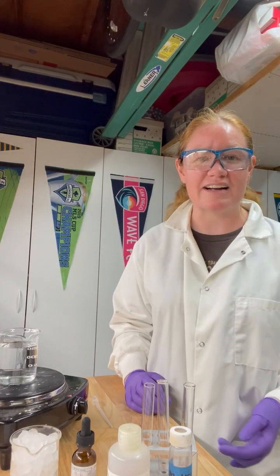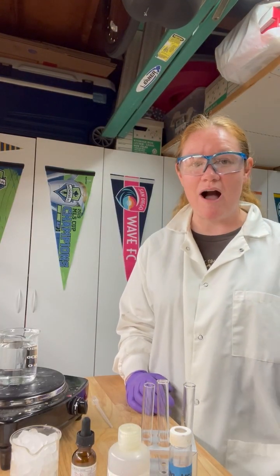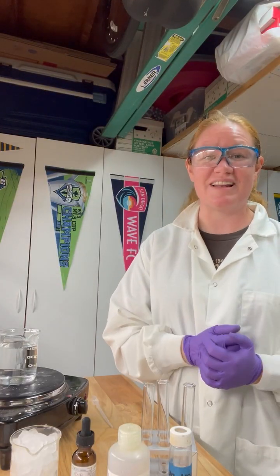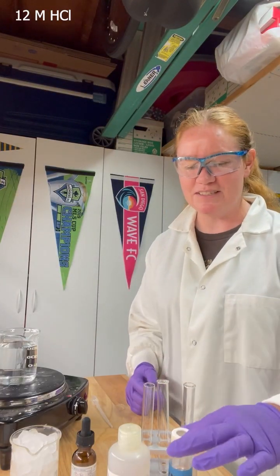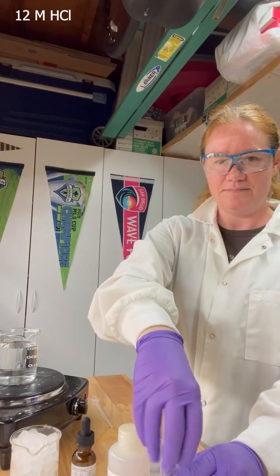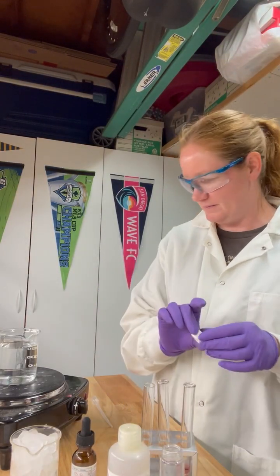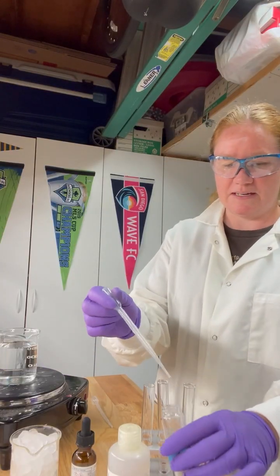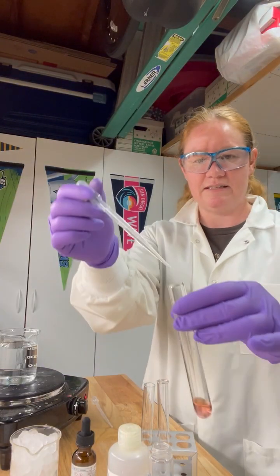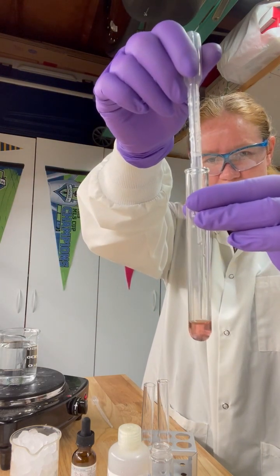Well, one of our two reactants is chloride ions. So I'm going to force this over to the product side by flooding my system with an excess of chloride ions. I'm going to do that by using 12 molar hydrochloric acid. So same thing, I'm going to get my pipette here. I'll get some hydrochloric acid and I'll drop it in there.